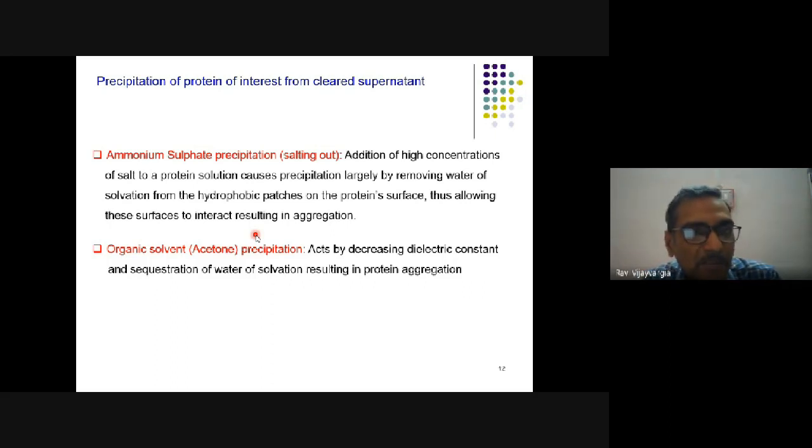So now you see that initially your protein was in say 50 ml of original lysate, but after ammonium sulfate precipitation, you collect different precipitates dissolved in just say 1 ml, and then on the gel, you see that most, 90%, of your protein is now present in say the 60% ammonium sulfate concentration pellet. So from 50 ml, your protein is now present in 1 ml, plus from say 10,000 proteins, the contaminating proteins present in that fraction are only say 200.